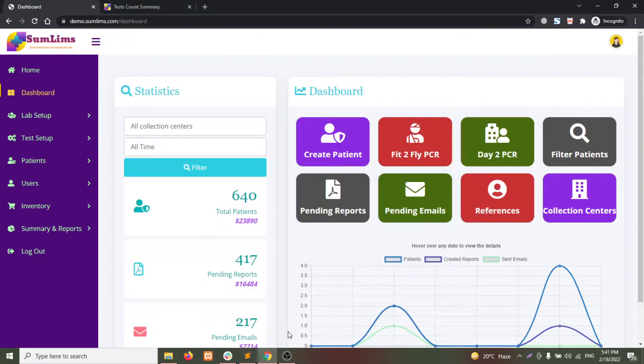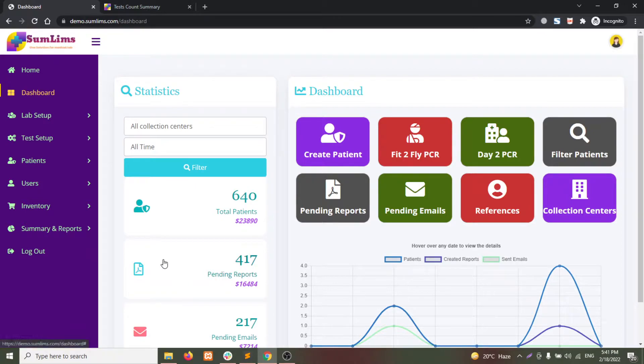This video is about how you can export the test list with rates. This is useful when you are working with different vendors.